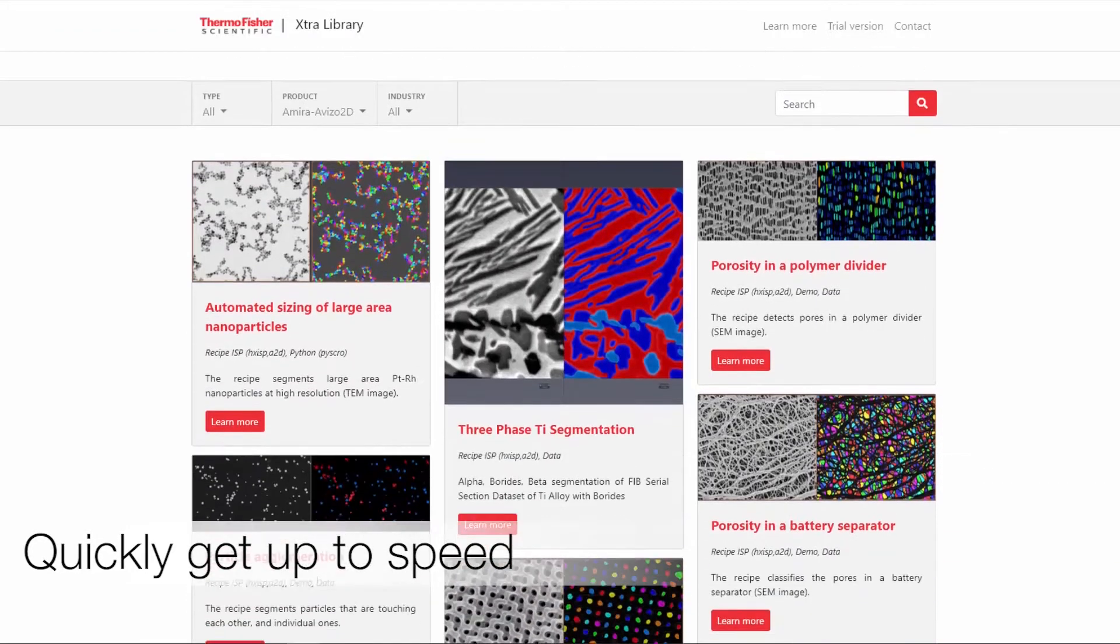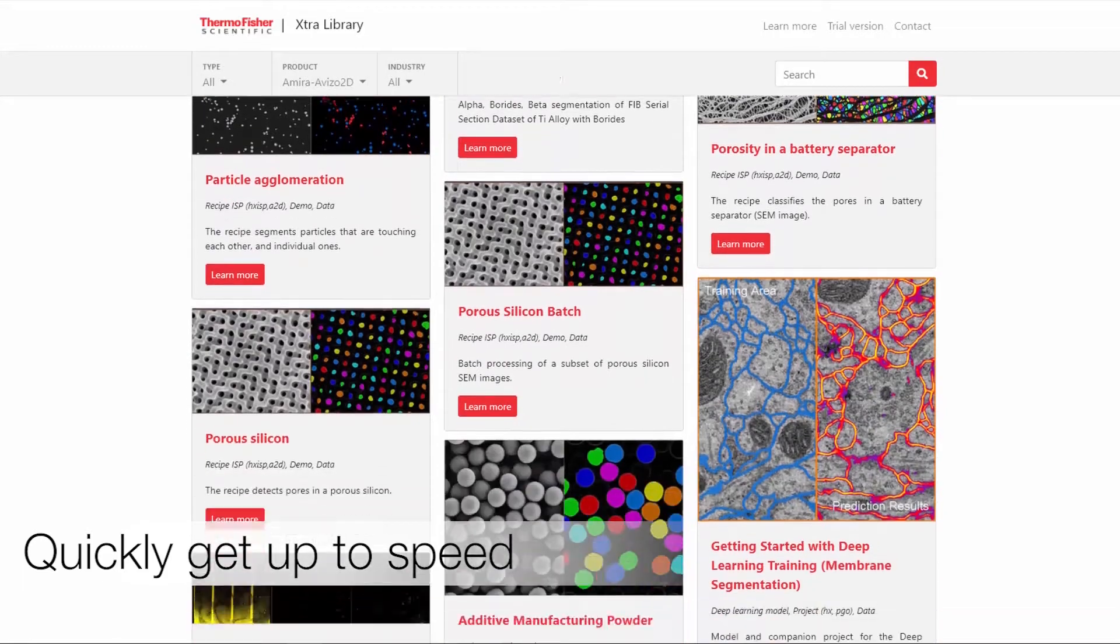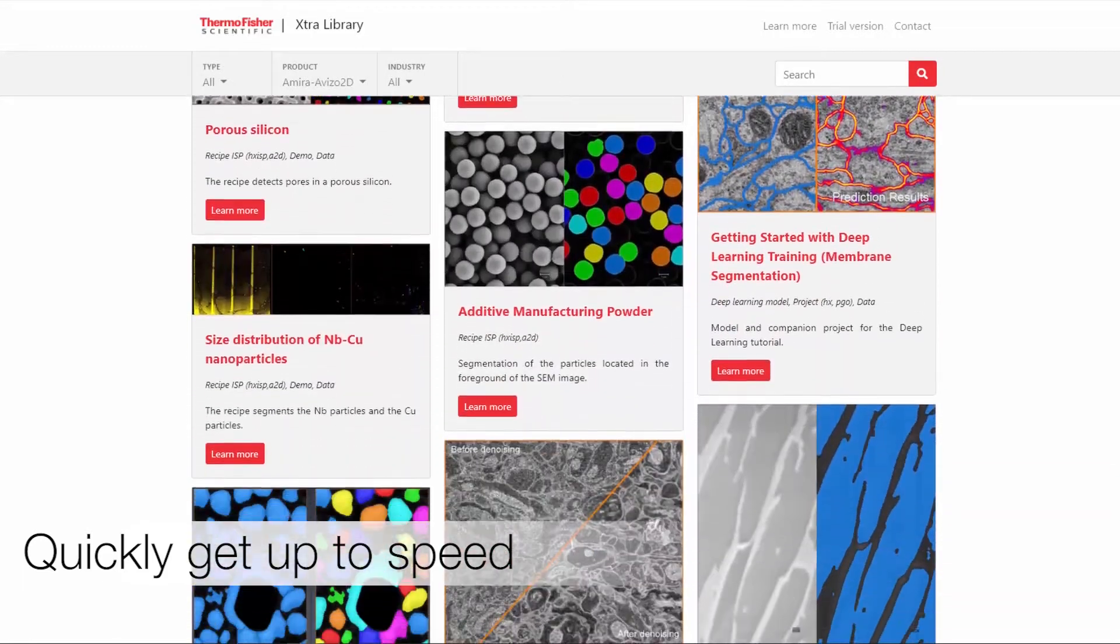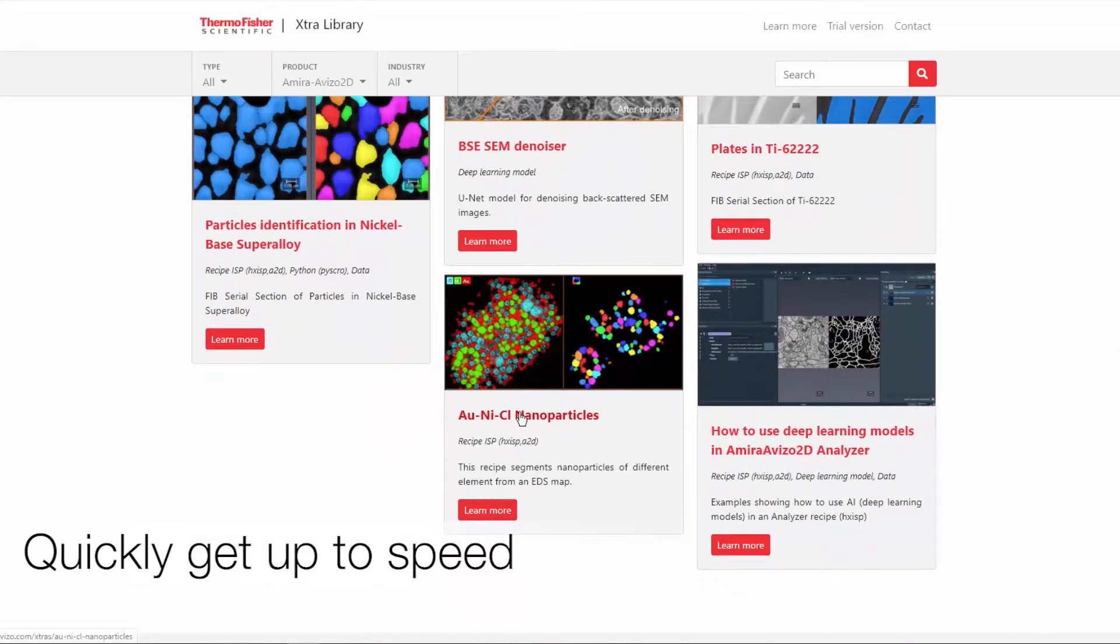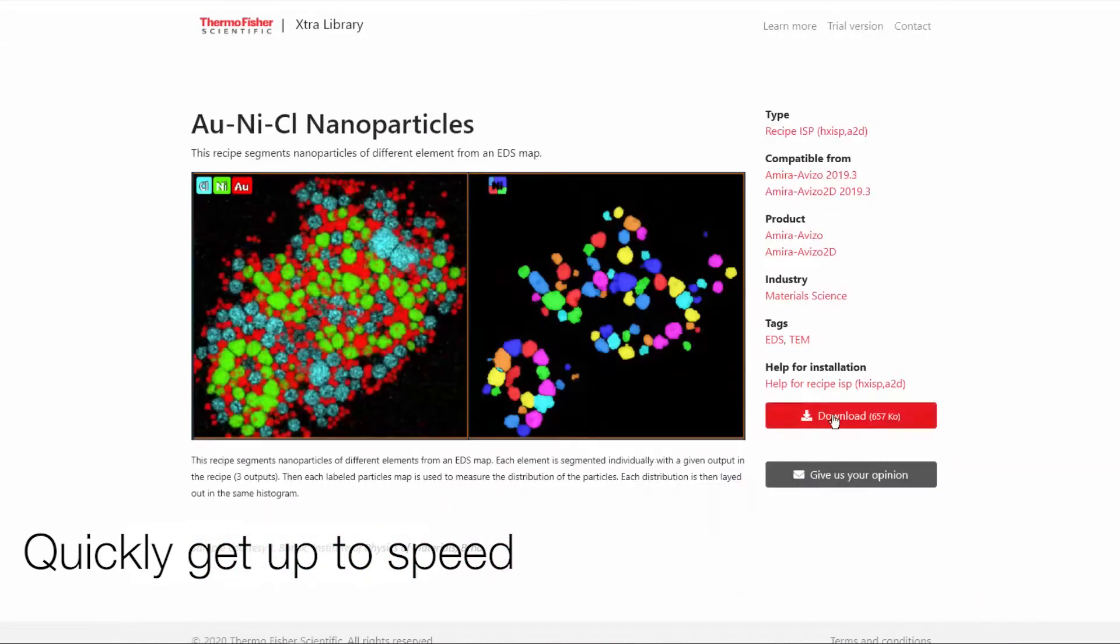To allow you to quickly get up to speed, Aviso2D software comes with an online library providing ready-to-use recipes.